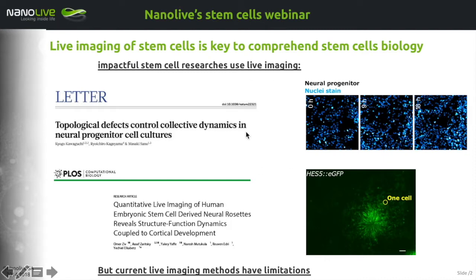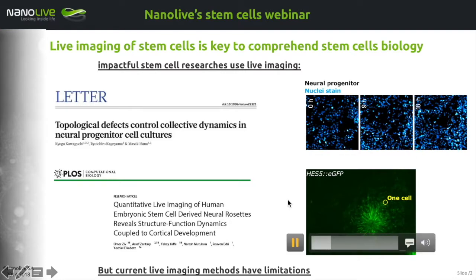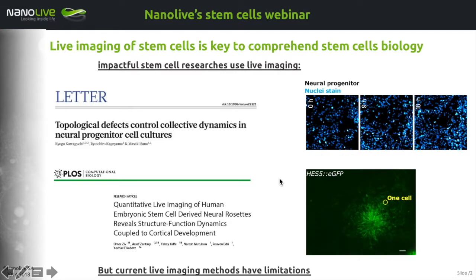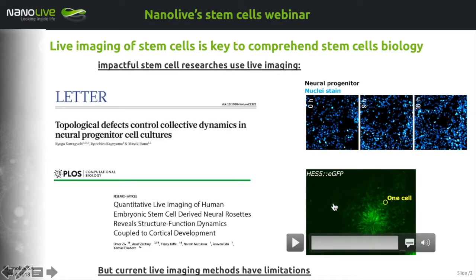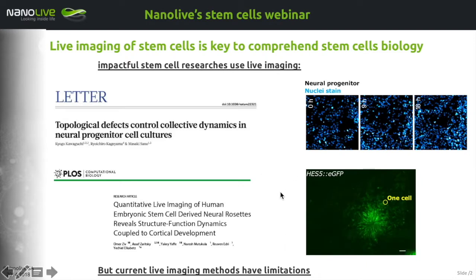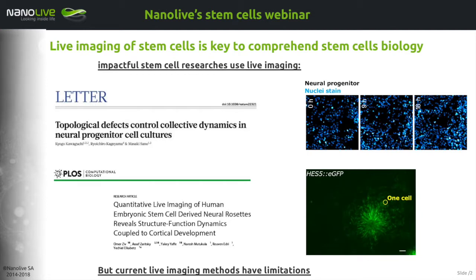You can see here, for example, a time-lapse imaging of neuro progenitors over 18 hours monitored with just three time points. You also see here stem cells stained with GFP, developing over four hours with one image every five minutes. This shows that live fluorescence imaging is a great tool that has led to major discoveries.